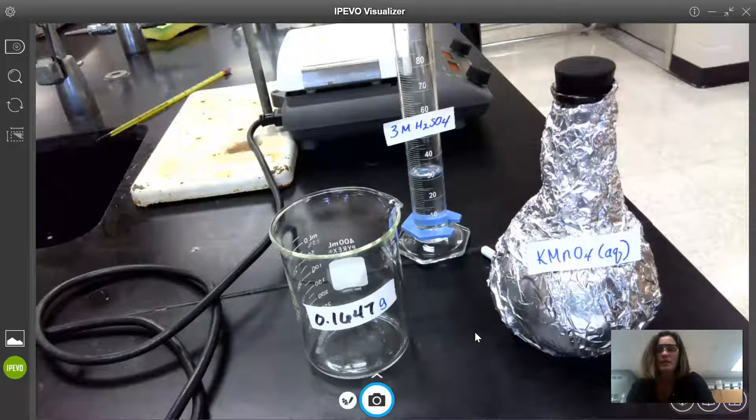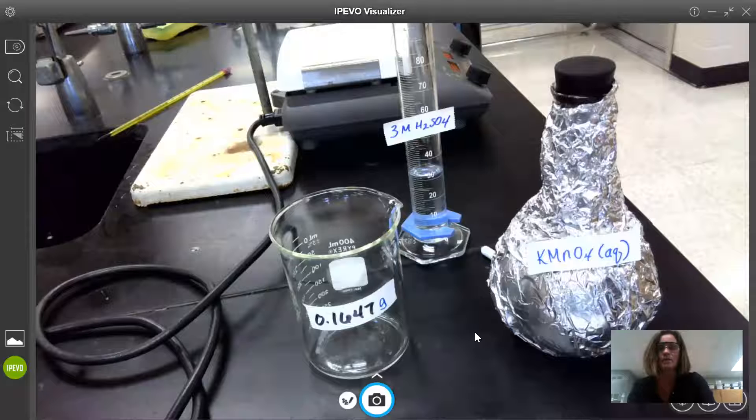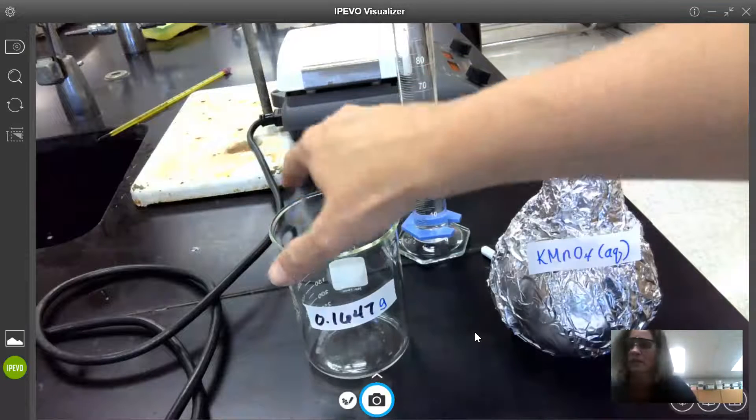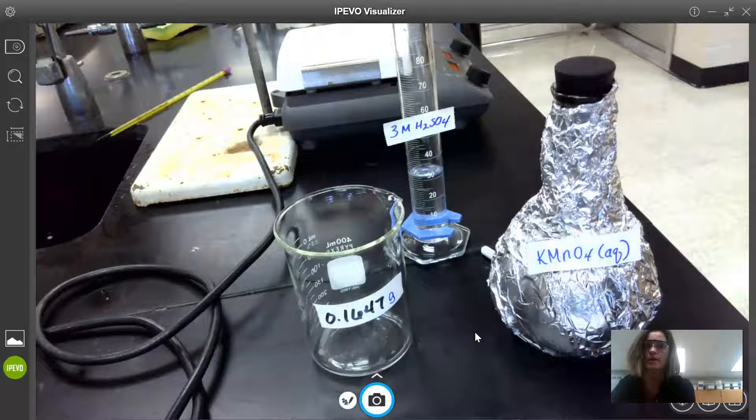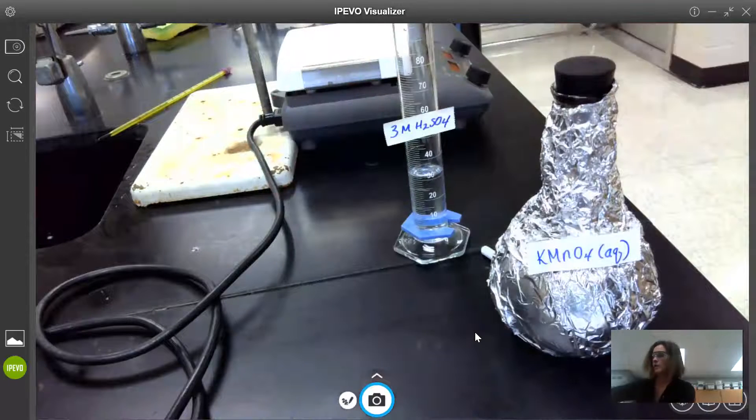So following instructions 8 through 15 in the lab handout. The first thing we're going to do with our sodium oxalate is to add about 200 milliliters of deionized water which I will get from the deionized water container.